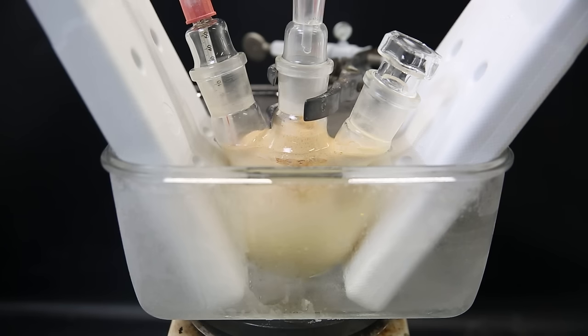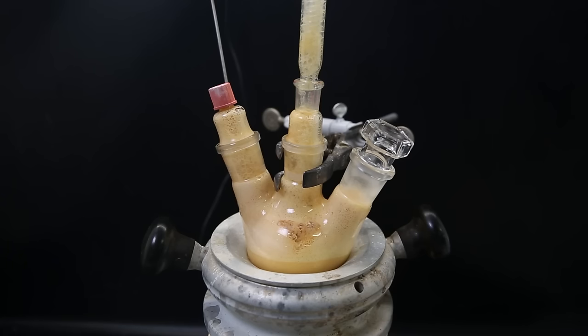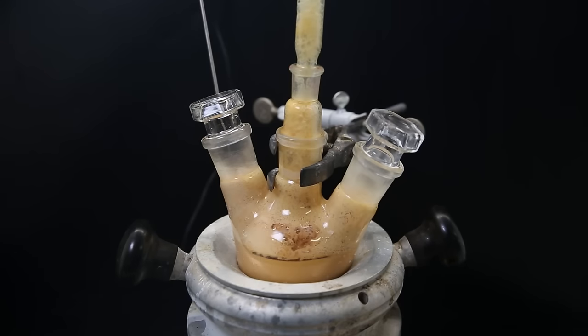During the addition, the mixture turns light yellow and it starts foaming a lot. When the addition was complete, I quickly replaced the dropping funnel with a small condenser so that it doesn't spill over. Eventually, the foaming stopped, and it didn't spill over. I left it to stir for 1 hour in the ice bath, and then 1 day at room temperature, to make sure that the reaction is complete. When that was done, it had become slightly darker in color.